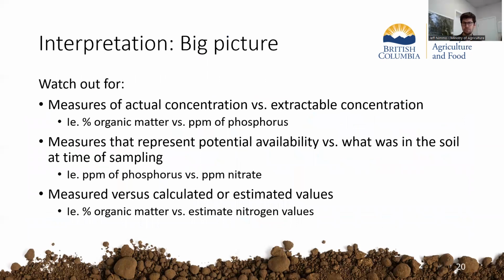So it's a lot of technical stuff, and in part the reason for berating you about the different ways things are analyzed within soil samples is, I think, to reinforce some of the big pictures and areas that I'd encourage you to interpret slightly differently on the piece of paper. So the things you want to remember or watch out for when you're looking at these is to think differently about measures of actual concentrations of things versus things that are an extractable concentration.